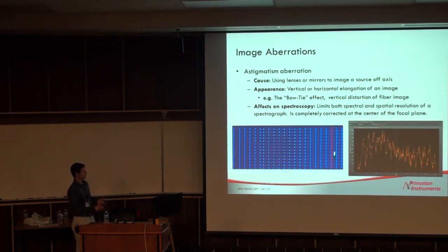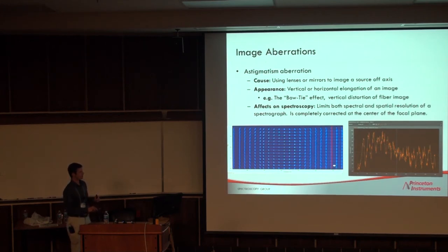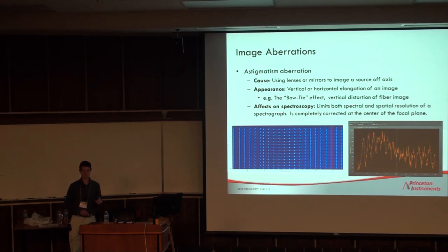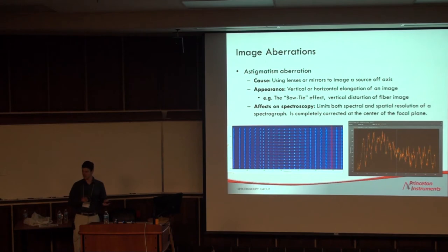Looking along the vertical direction, we should see individually resolved images. Instead, there's light where there shouldn't be, which affects quantitative measurements — you may think you know how much light contributes to a particular peak at a particular wavelength, but that might not be the case. Especially at the corners, the peak profiles are actually rotated and stretched, including in the horizontal plane — the direction of wavelength dispersion.